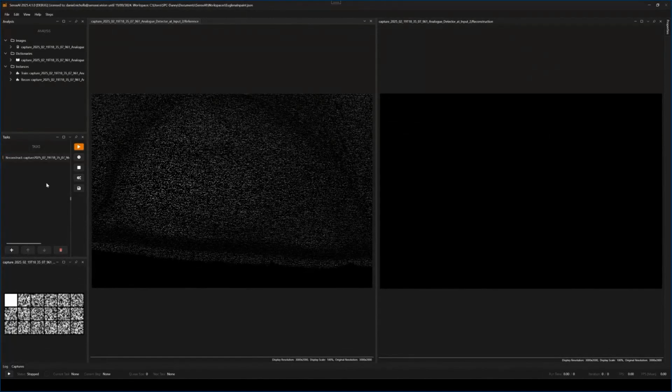For applications such as these, the imaging of biological materials, high-dose imaging simply isn't possible, and so pushing the limits of the system using subsampling and inpainting is incredibly useful in maintaining high-quality data without destroying the sample.